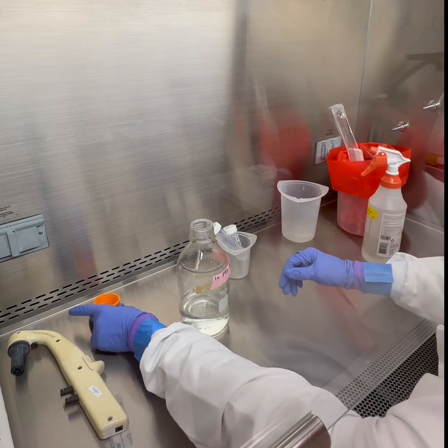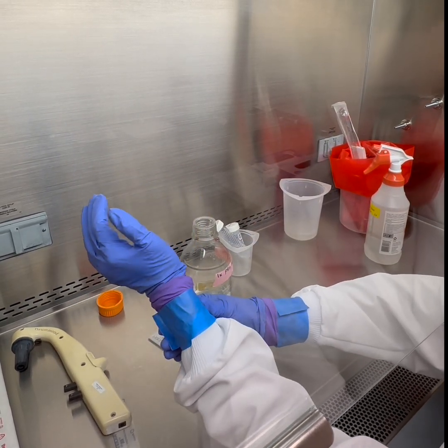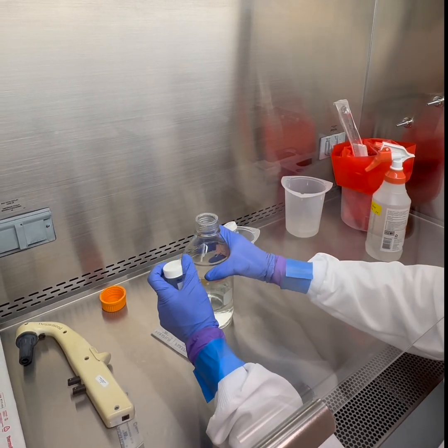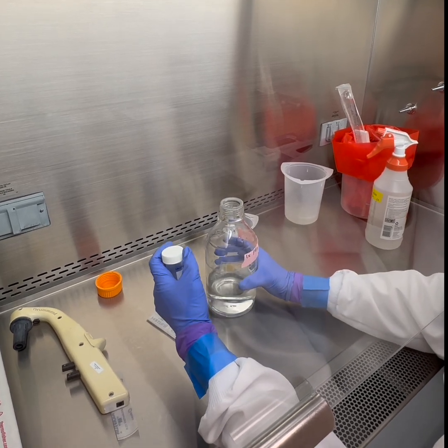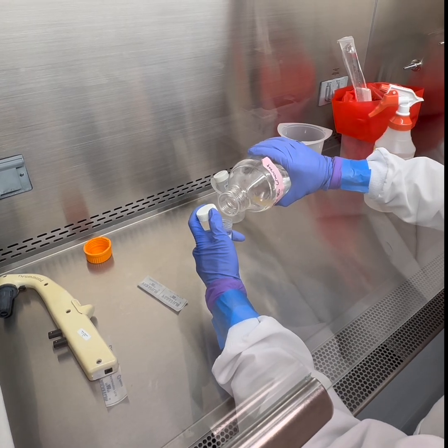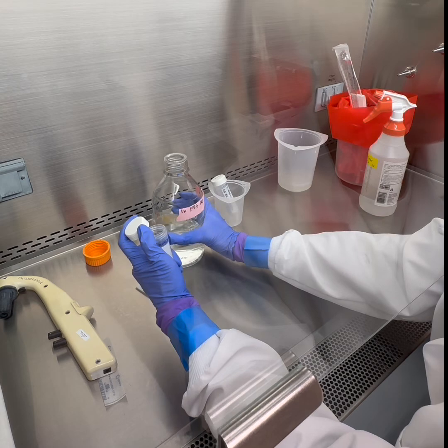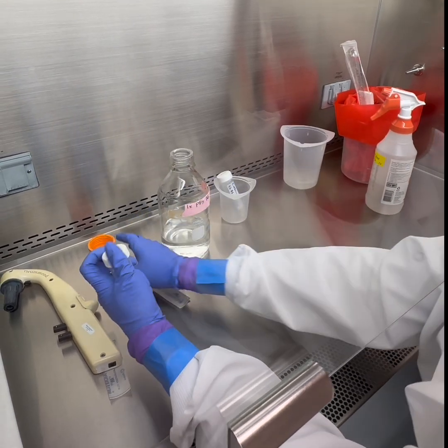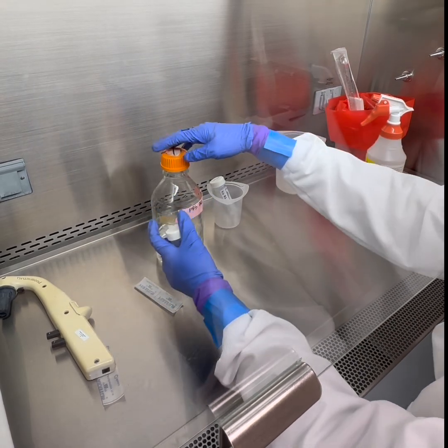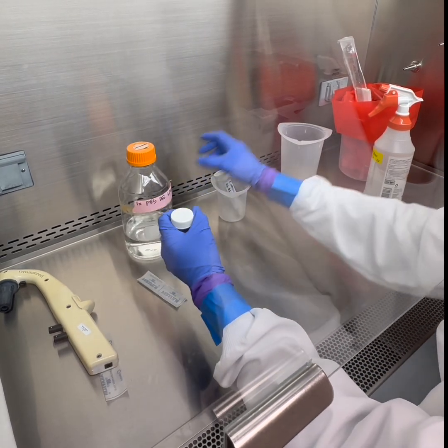So, following good aseptic technique, we're double gloved, and we've also taped a seal on our lab coats. If you're doing this with auris, then you'll want to have a disposable lab coat on as well, and bleach inside the hood. So I'm just going to pour some, avoiding touching the tip to anything. All right, we're good, because if you touch the threads, then you kind of contaminate it. And you notice I tilted it, you don't want to be hovering over anything. All right, so I got about 25 milliliters.